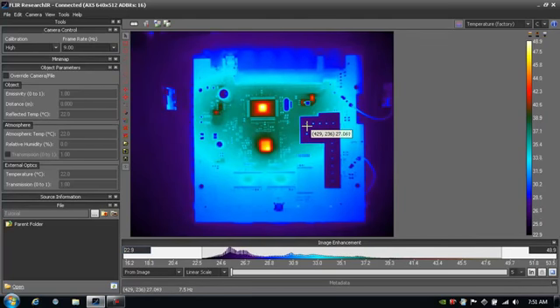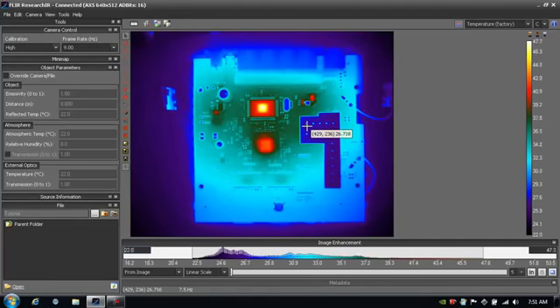Today I'm looking at a printed circuit board, and what we're going to do is cool it down and record a movie as it heats up, perform some analysis, and then share the data, and show different ways to export it. So let's go ahead and get started. I'm going to turn off the printed circuit board. You'll see it cool down here.